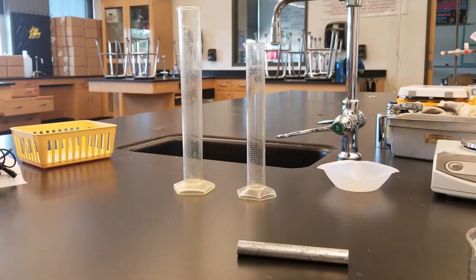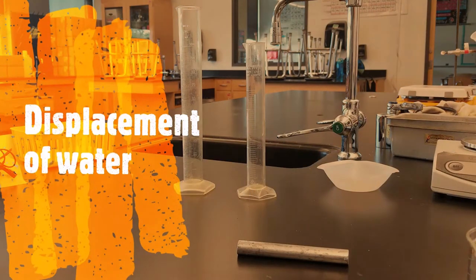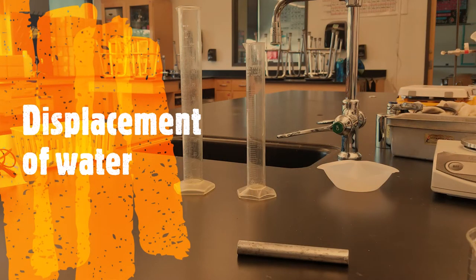In part two we are going to measure the volume of each of the five objects by using the displacement of water. Take a fifty milliliter graduated cylinder and fill it up to twenty-five milliliters.